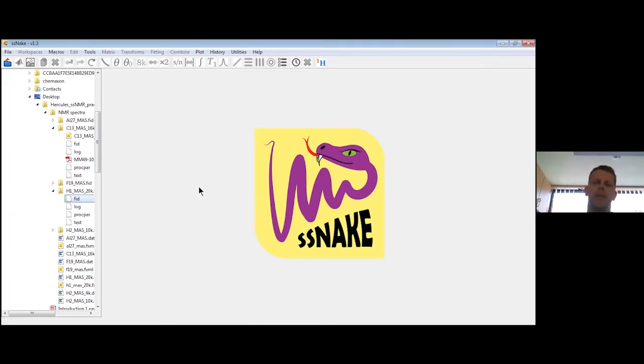As I said, this is not the program that I'm really working on, so I'm not very familiar with it, but I know how the basic things are done here, and you will see that the basic things are done very easily. Of course, the program offers more things, but you can learn these things later on if you need them.